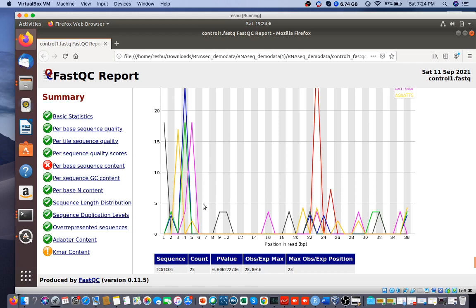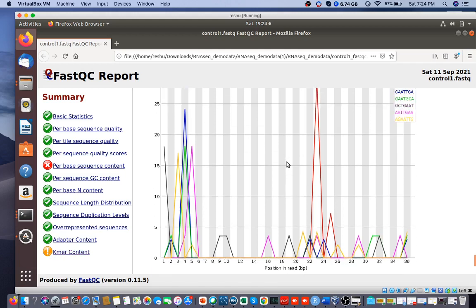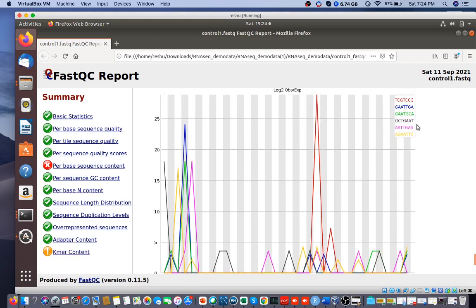And these Kmers maybe you can get because of the DNA shearing as well, if these are at the initial sequences. But since this is the orange color, you need not worry about it. Usually they are 7 nucleotide long sequences, and sometimes they are at the start of the read, sometimes in the middle of the read, and these can be due to the shearing of the DNA.